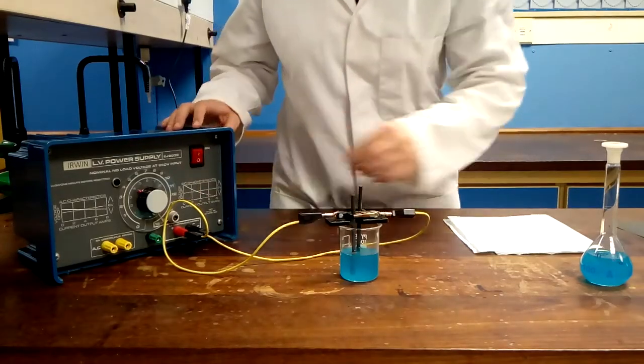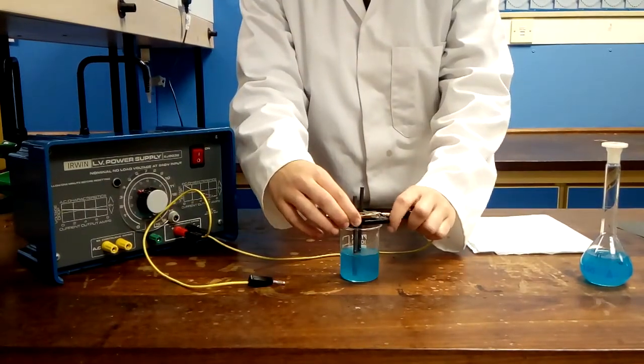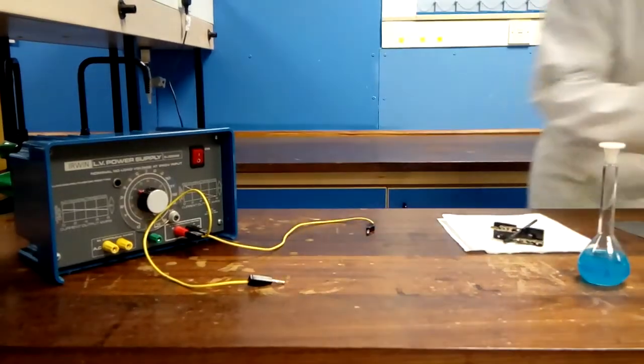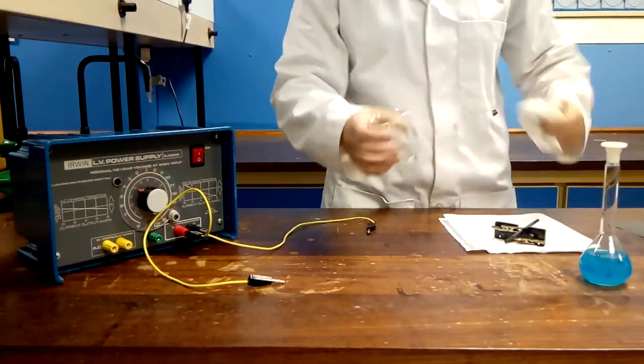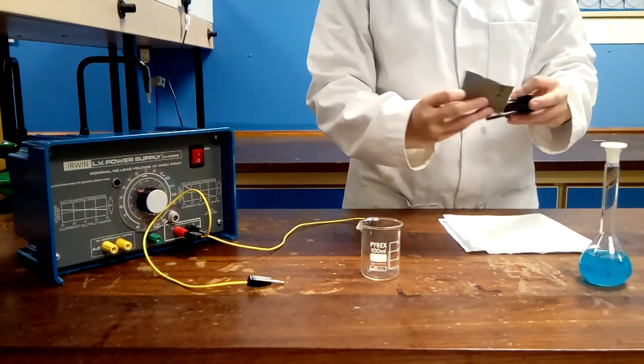Switch off the power pack and disconnect the crocodile clips from the electrodes. Clean the equipment carefully. Discard the salt solution and rinse the beaker out with water. Use emery paper to remove metal deposits off the electrode.